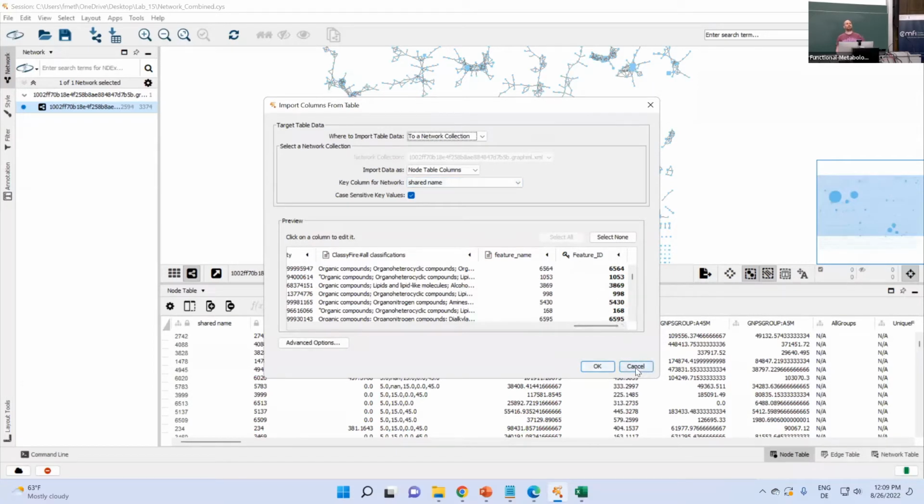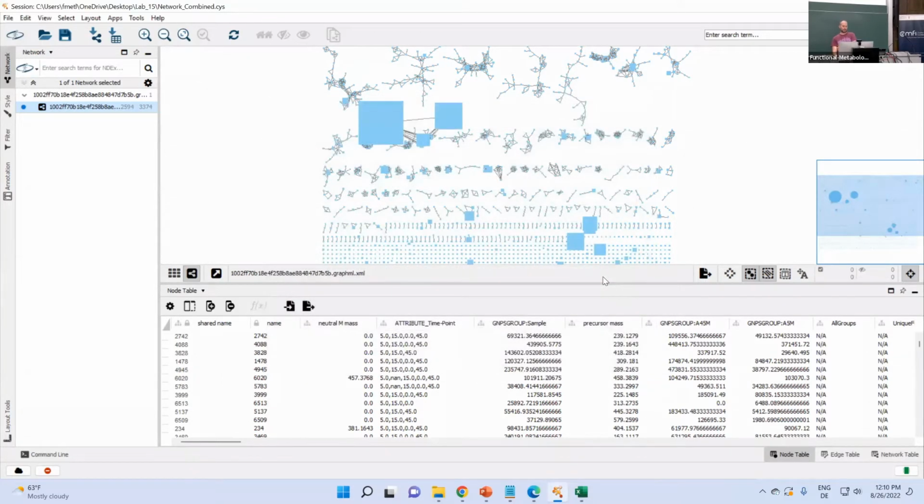Okay. Frank? Yeah. So if our Canopus was now finished successfully, and just for a test, if Sirius stopped in the middle and only processed half of it, you can write the summaries anyway, and then it will just write it to the feature where it got to. Obviously, if this is an important data set, you want to make sure that all the features went through. But for test purposes, feel free to do it also with the partial thing.